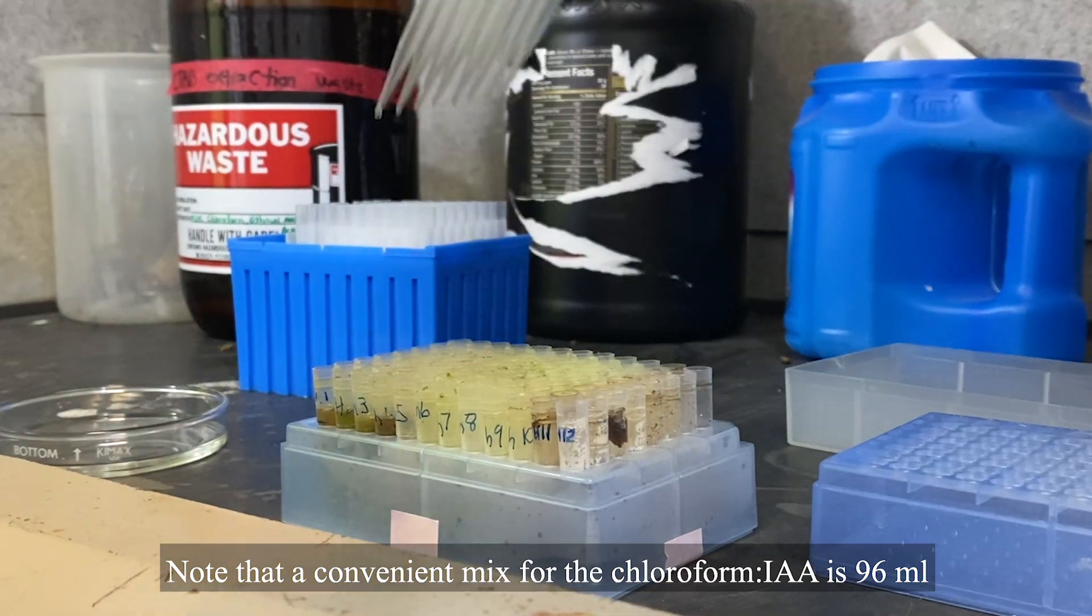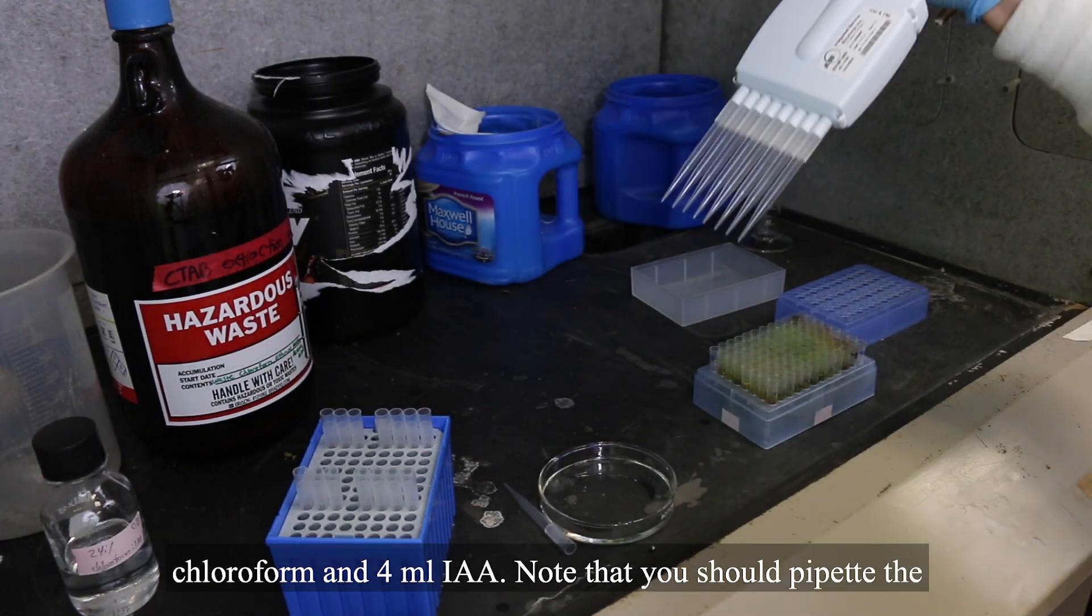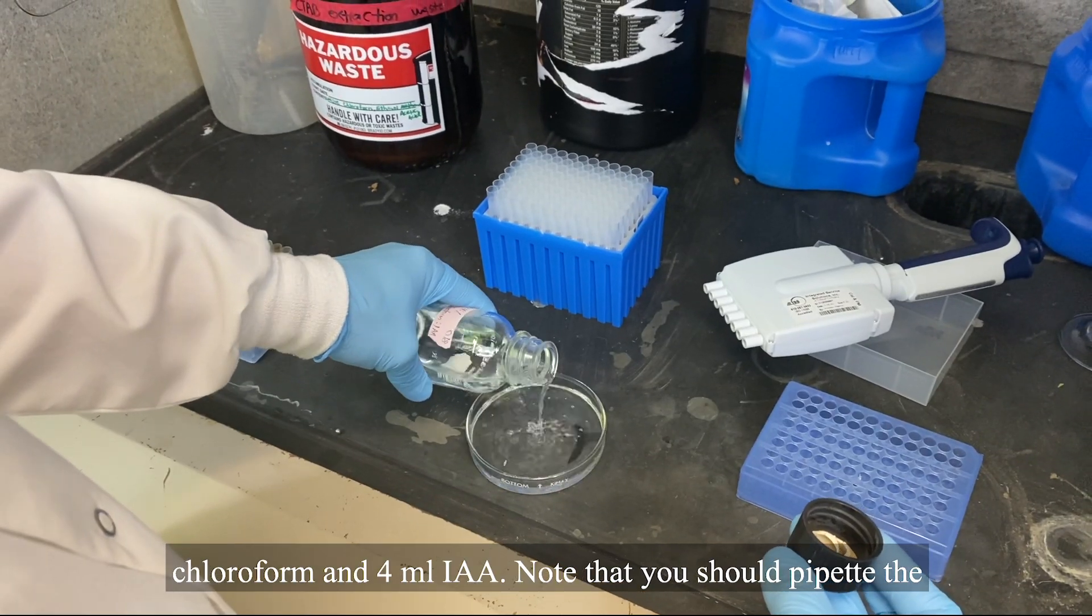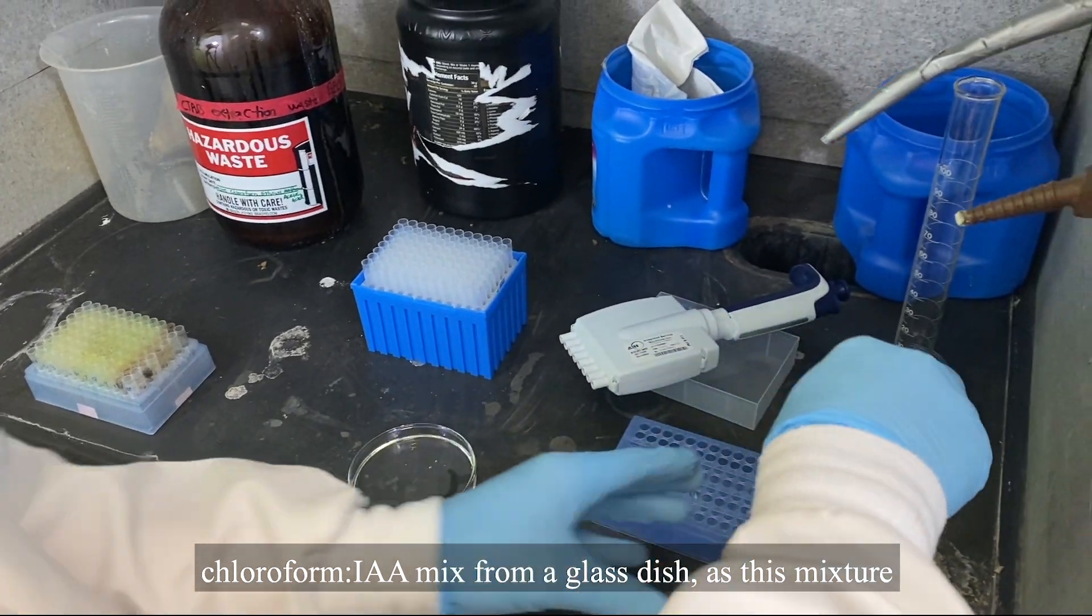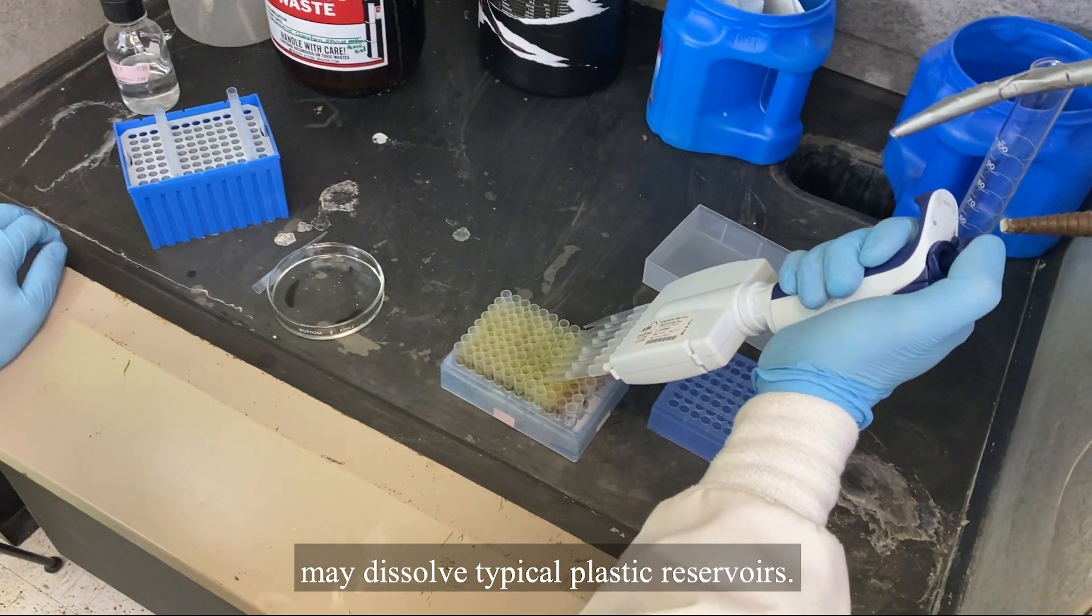Note that a convenient mix for chloroform isoamyl alcohol is 96 ml chloroform and 4 ml isoamyl alcohol. Note that you should pipette the chloroform isoamyl alcohol mix from a glass dish, as this mixture may dissolve typical plastic reservoirs.